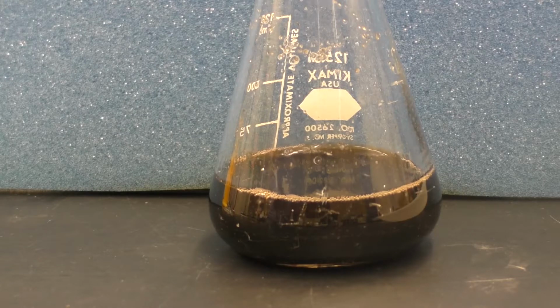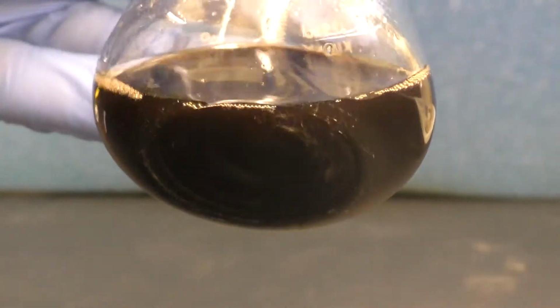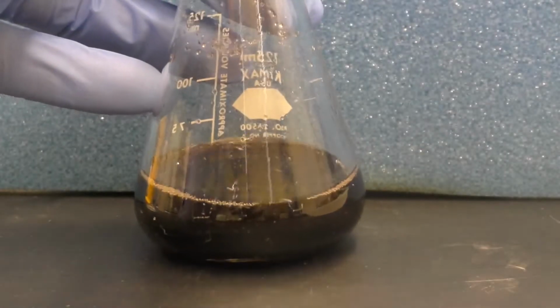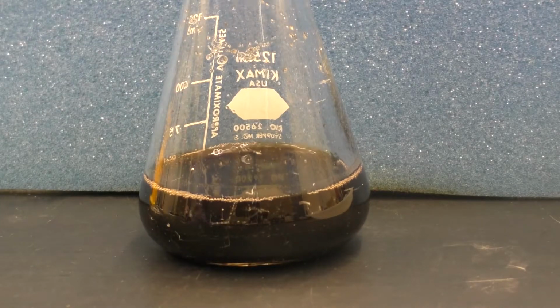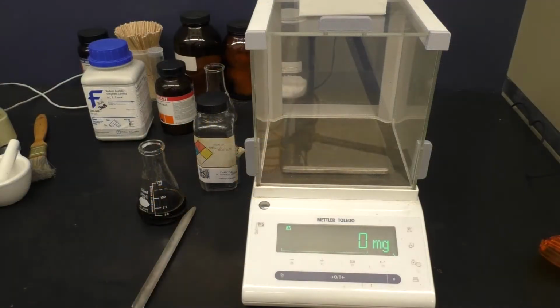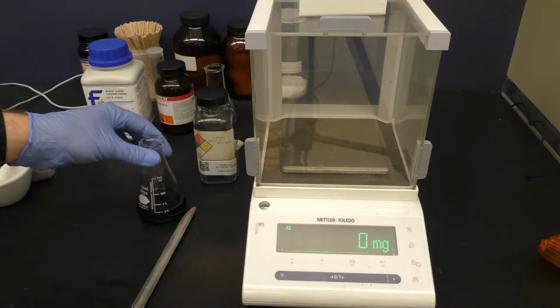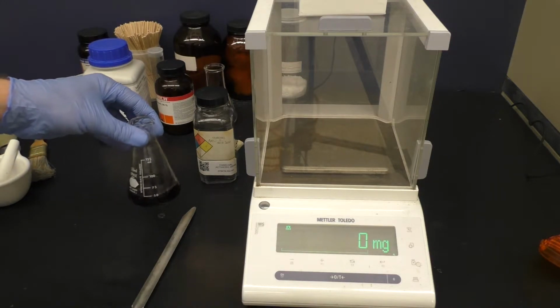So in total, after the very first initial 1.5 milliliters of HCl, we added about 2 more milliliters of concentrated HCl, and you can now see that we are fully soluble. There's none of that remaining solid around, so now we're good to add the 500 milligrams of activated charcoal and heat this on a hot plate for about 15 minutes to allow the decolorization process to occur. So here we've got our charcoal. We'll weigh out 500 milligrams of this and add it into our flask containing the solution of 4-aminophenol.